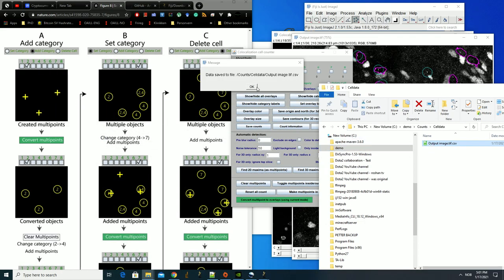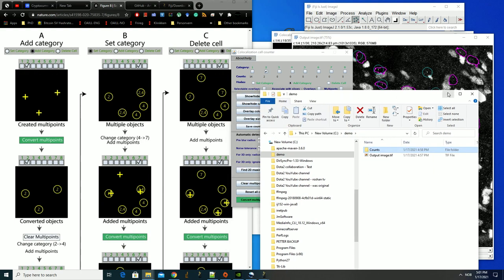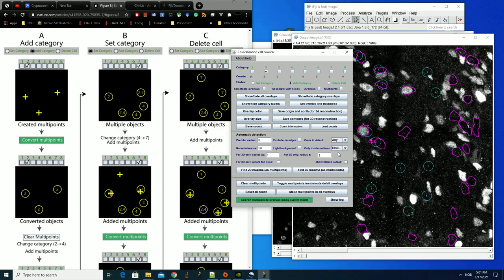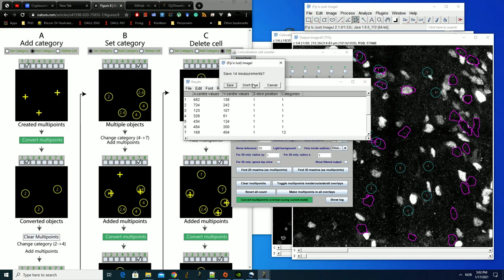And this data is used to save and load the counts, and to analyze later in the Excel file and make 3D modeling as well. We will look at that. But that's basically the idea behind this. And now we could reset all of these counts. OK, and we could load the counts again. Click OK, and now these are loaded again.